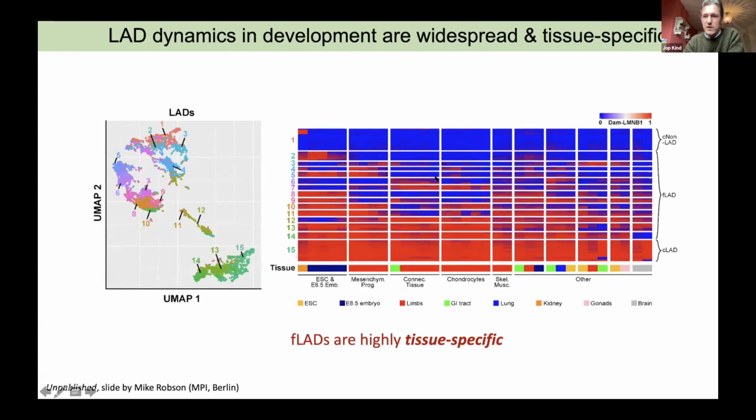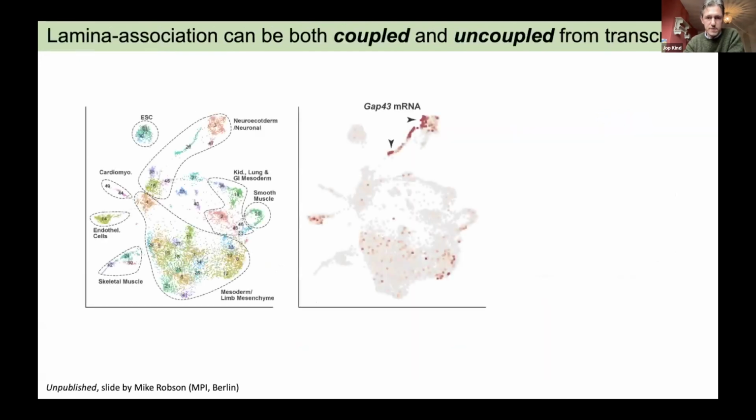And now we can see how this corresponds to change in gene expression. Because we have these two modalities, we can very nicely look at the same analysis as I showed you for the cortex, but now across different tissues. And again, we also have some brain development here, which is now E13.5. I'm just going to show you some examples of gene expression, just to give you a feel for the data. So I'm almost done.